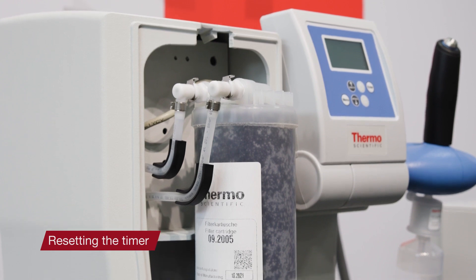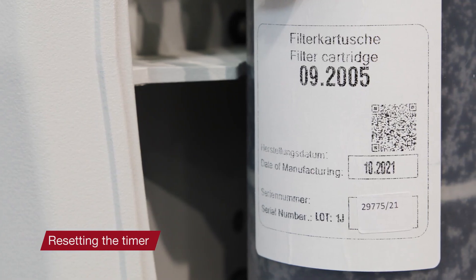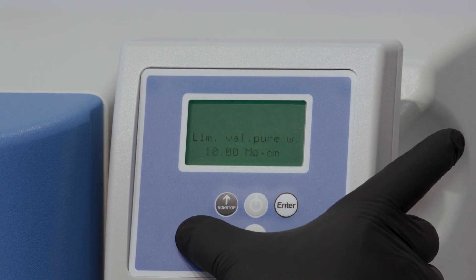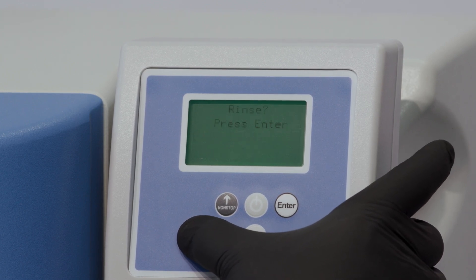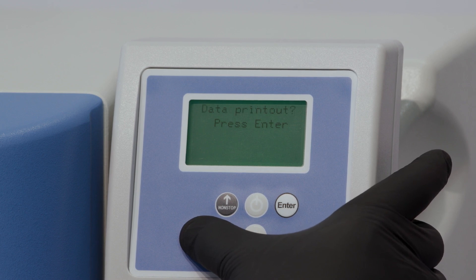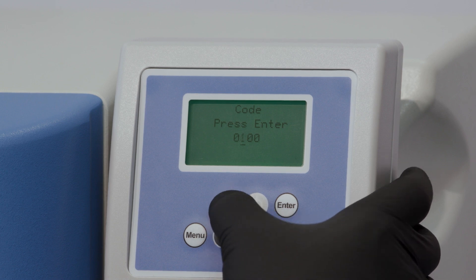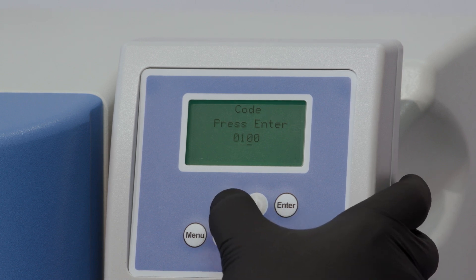You'll also want to reset the change cartridge timer by entering the new cartridge serial number. To do so, unlock the system by entering a level one code so that a cursor appears. Then press the menu button until you reach the code press enter screen. Type in the level one code 0150 and press the enter button to confirm.